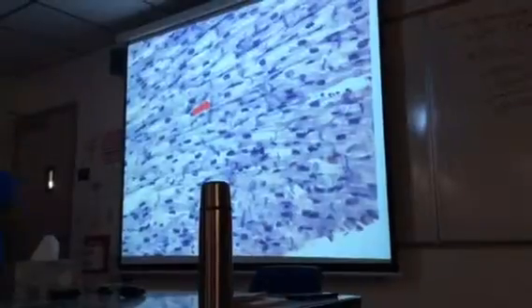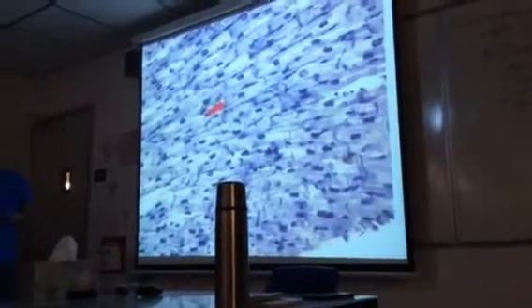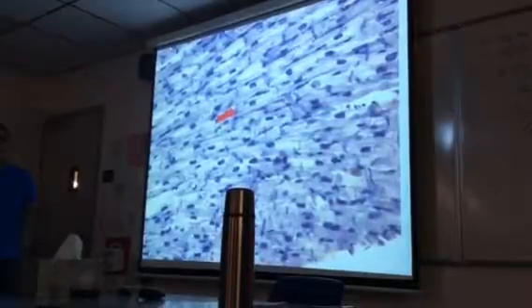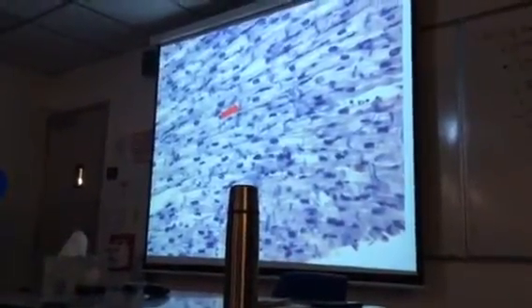Right, this is cardiac muscle. So that's what you've got to know. Some people call it cardiac tissue, and that's incorrect, because remember, cardiac describes its muscle tissue. And I might ask you to identify any of these structures here. I'm pointing to one there: intercalated disc. So know that it's cardiac muscle, not cardiac tissue. That was the heart.